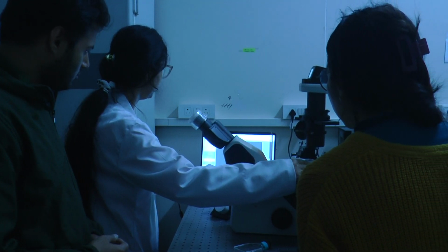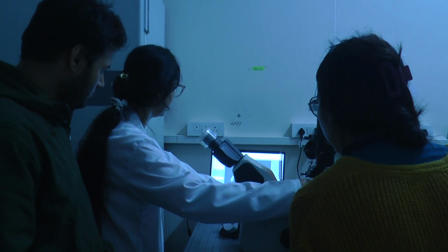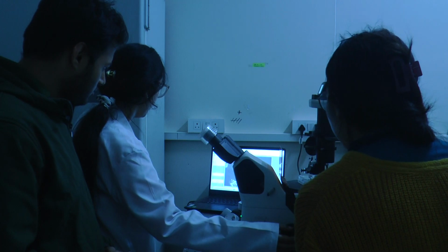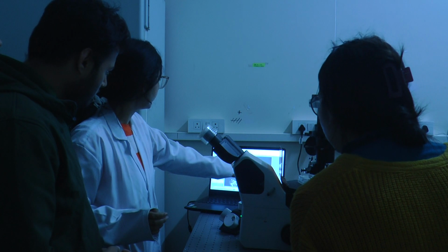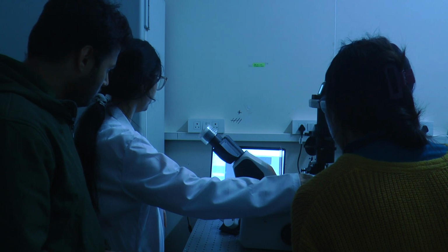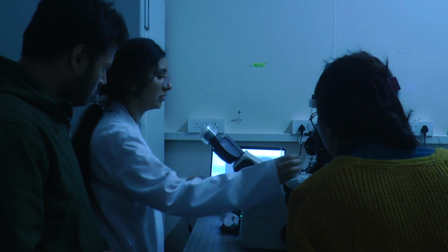GPMVs are there. These are the free ones. These are the adhered cells. Okay, so this is the circulating. It might need more circulation, but still they are there. This is the merging out. So these are the free ones.